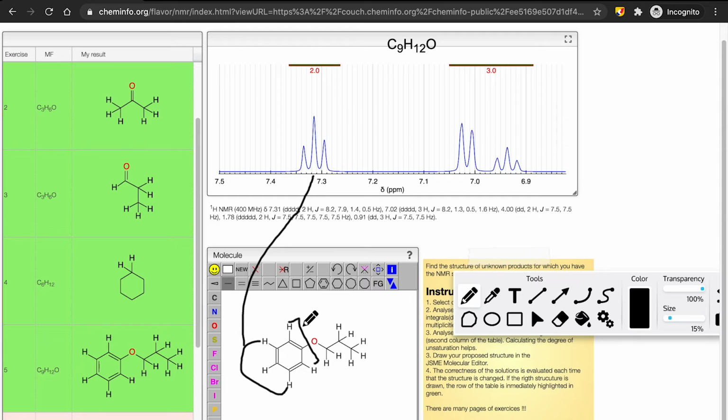Okay. These 2 hydrogen, you can see that this spectra has been integrated such that these 2 peaks are actually equal 3. So this one right here has an integration of 2. And then this one has the remainder integration of 1. Okay, so these 2 hydrogen correspond to these 2 hydrogen right here. And that's because these each have 1 neighbor.